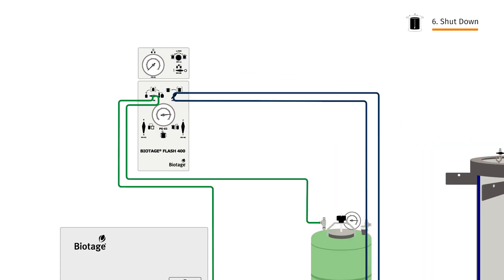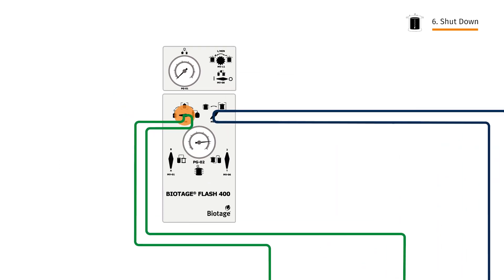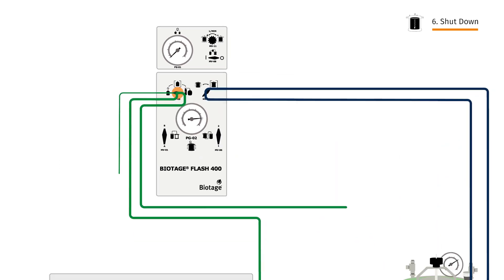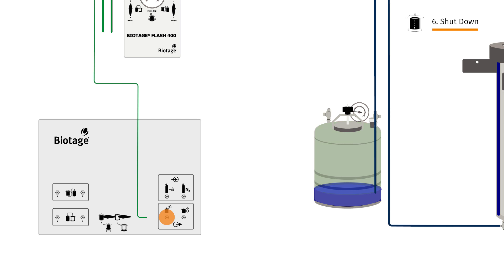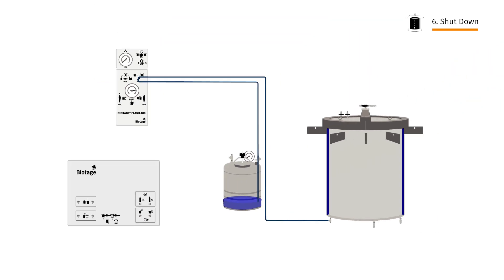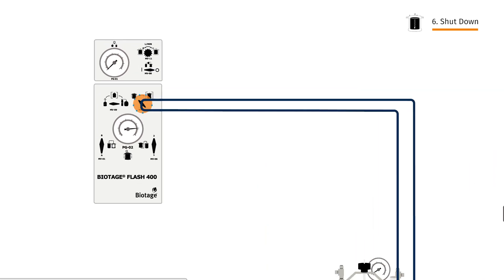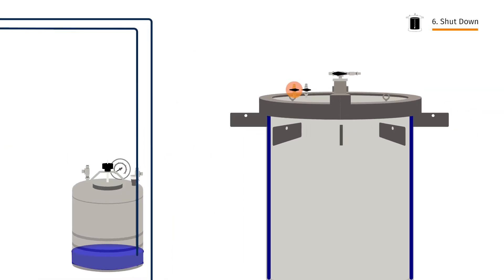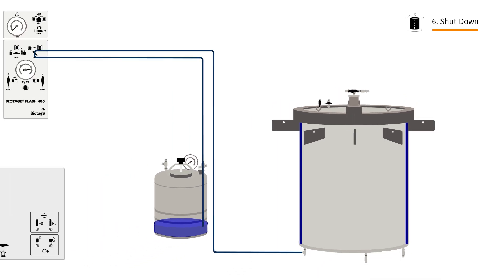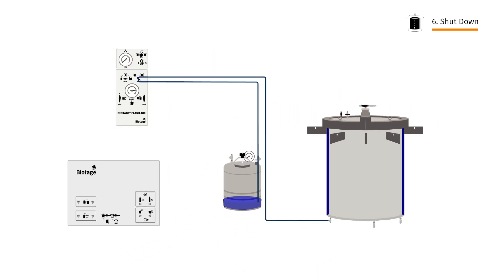Depressurize the compression fluid reservoir by opening the vent valve, which releases nitrogen through the exhaust on the side panel. Drain compression fluid by first opening the compression valve on the control panel and the vent valve on the compression module head. Then empty the fluid via the drain valve on the side panel.